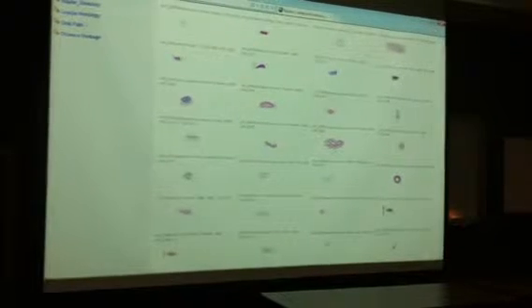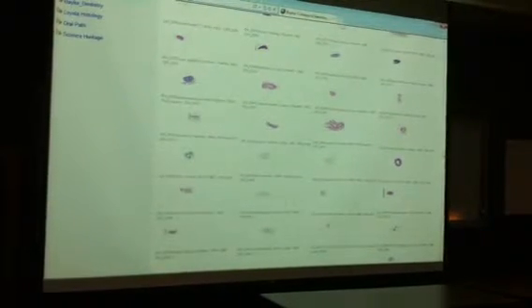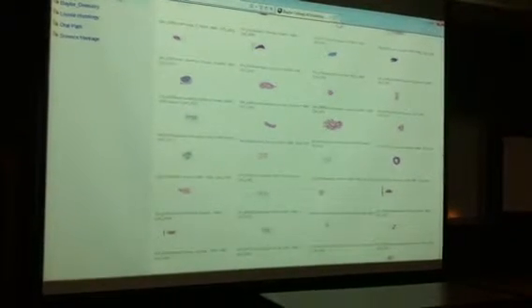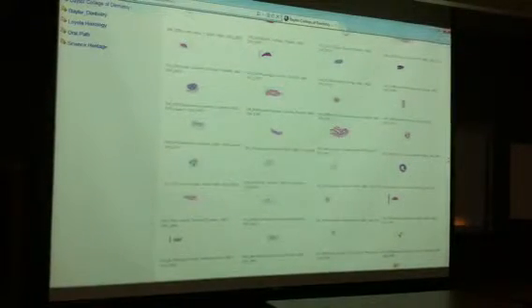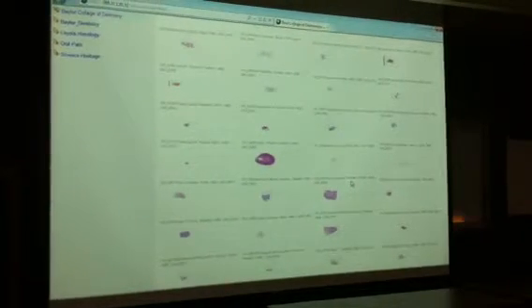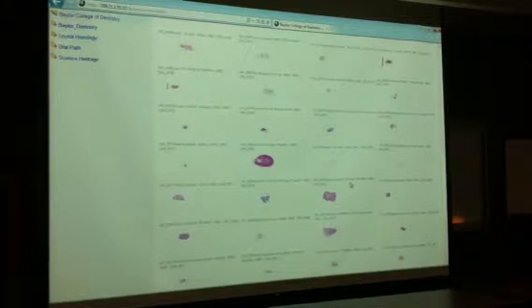What type of growth does it go through? You tell me. Okay. Why would you say that? Okay. Does it have isogenous groups? Not that many. Still, it does that. Everything goes through interstitial growth. Not everything goes through appositional growth for cartilages.